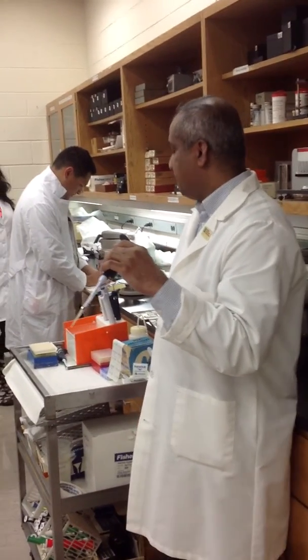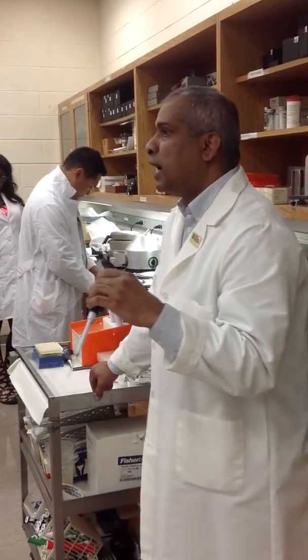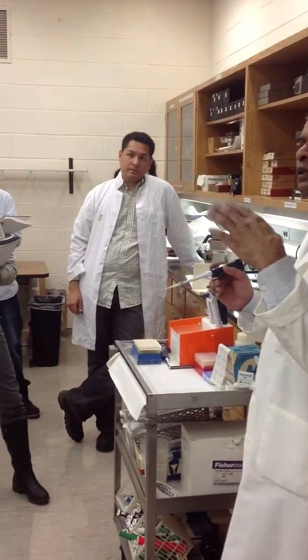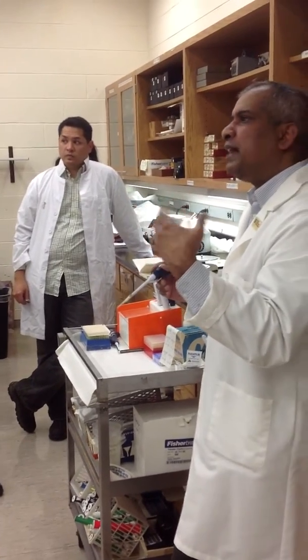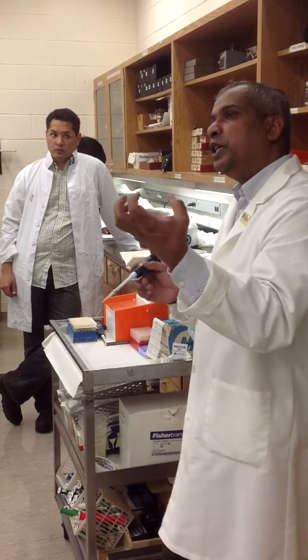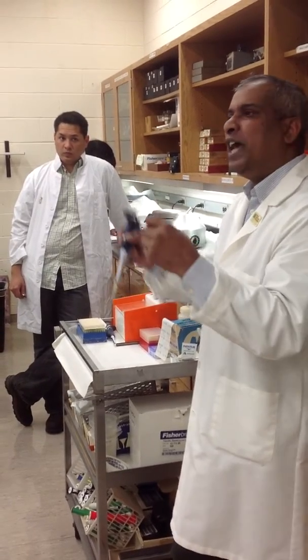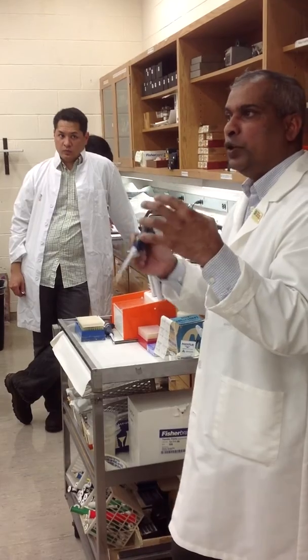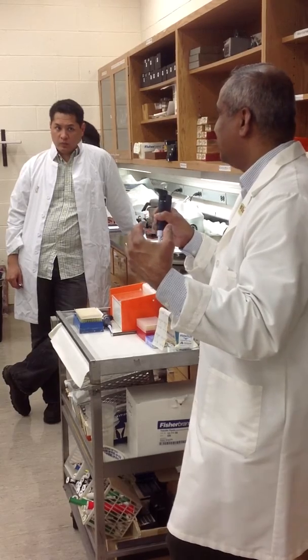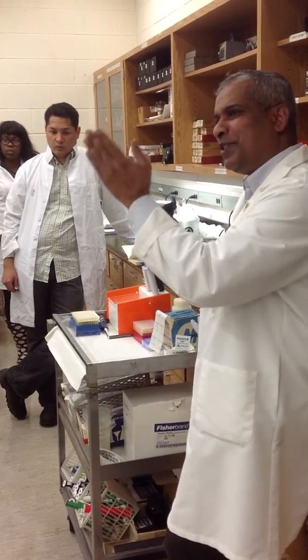I have a question. Every time you ask what is such and such milliliters, you're going to want the answer in microliters? Not really, because we're going for mLs. If I say, how much is 5 ml? Well, just take something and measure out 5 ml. But here we're saying 0.125 mLs. It's hard to measure that. So if you break it down into microliters, then it's easy to measure. Doesn't that make sense? That's why we have the metric system, right?